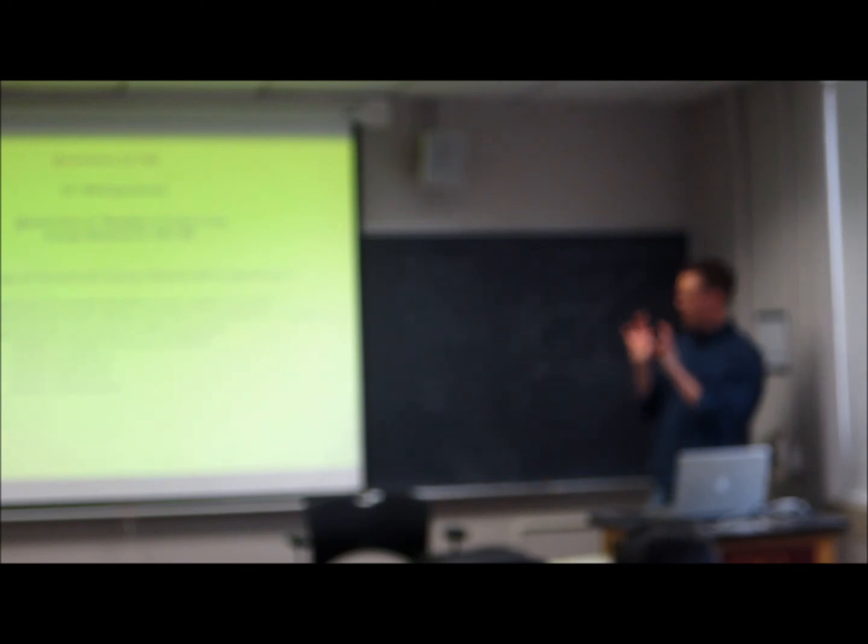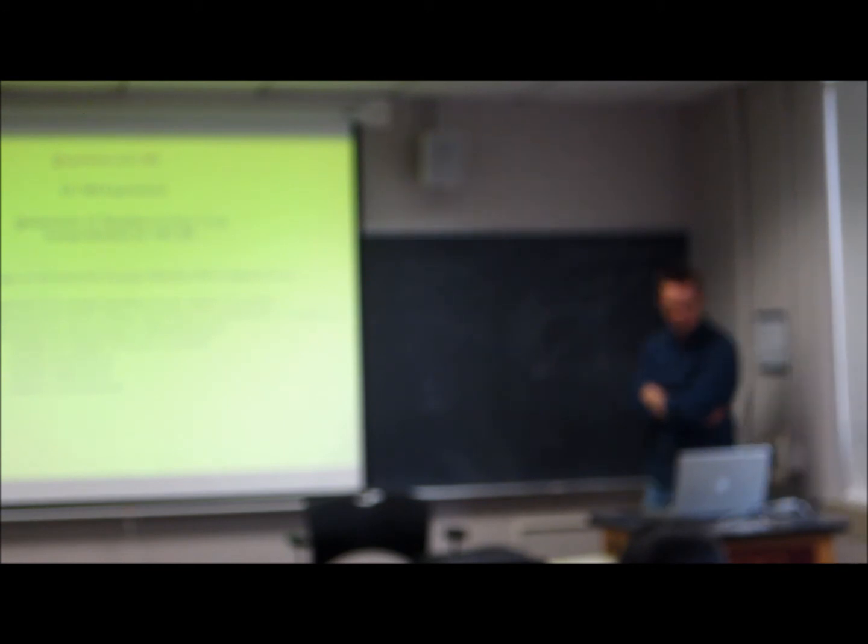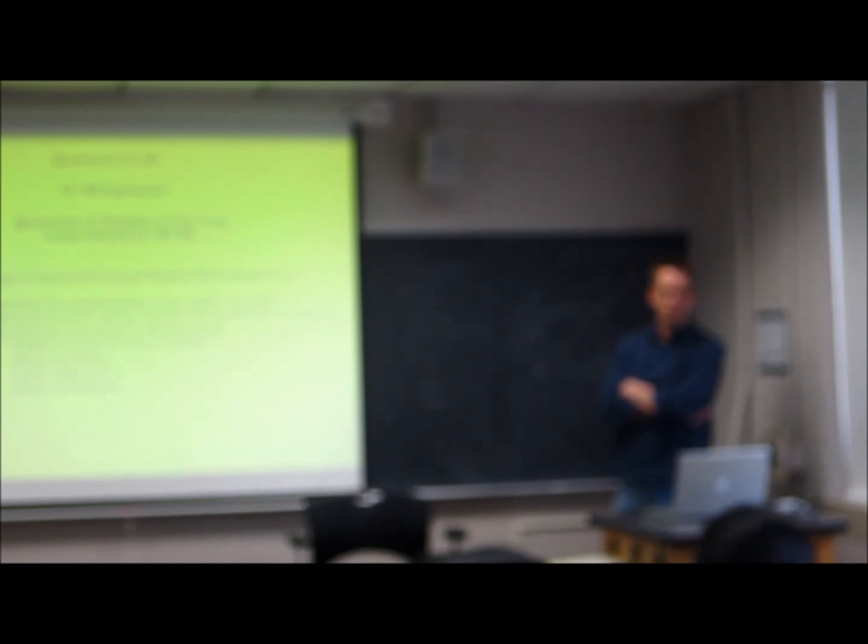So depending on how perfect you want to quantify, you may do quantitation in one of 2 ways. You do it via concentration, or you do it by mass. Doing it by mass is much more accurate. Any questions? That's about all I have in terms of material. I'm happy to talk about any specific applications you want to talk about.